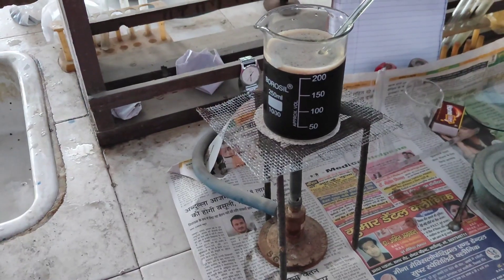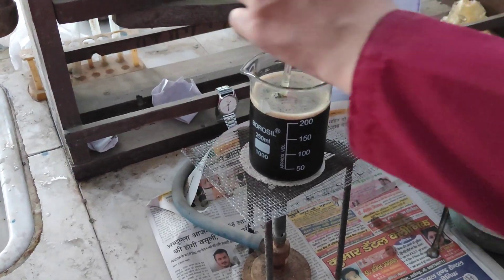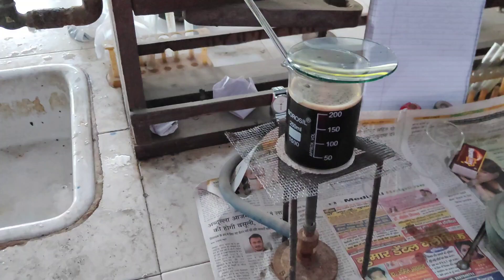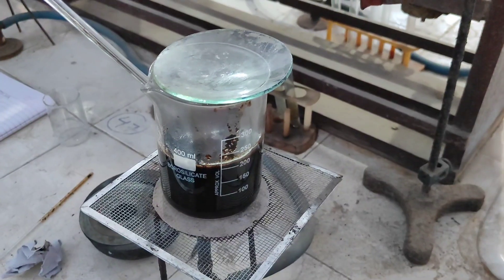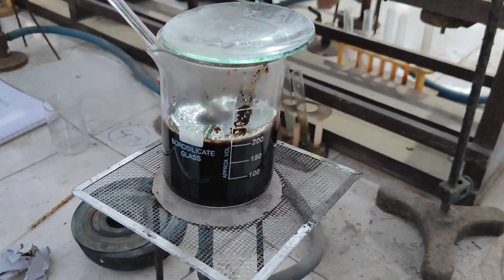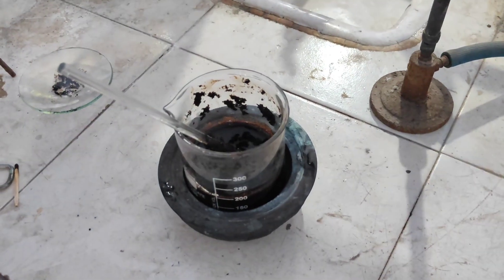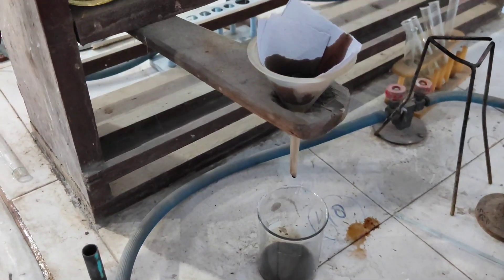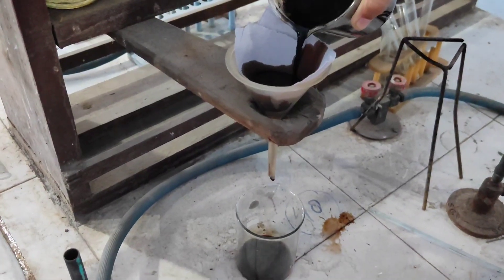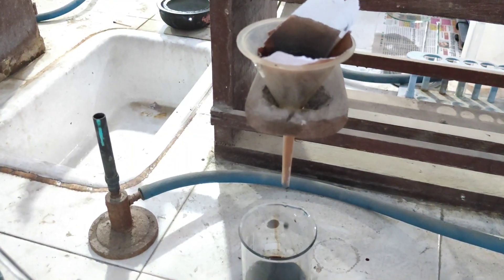After that, we put it on heating. We heat the tea leaves and sodium carbonate for around 30 minutes until it boils, to concentrate the tea solution. After heating for 30 minutes, we see the solution reduces to about one half, then we filter the solution to collect the caffeine.